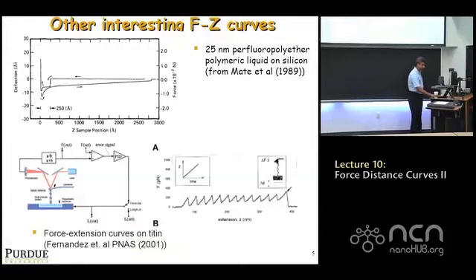Any questions? Yeah? Why, when you move far away, is the slope different? Yeah. So it turns out there are two hysteresis involved here. One is, good question, this one, what we would call short-range hysteresis, and that when you come in, it goes this way. When you come out, it goes out of here. That's one. But the second one is that you're coming in, you have this, and then here you've got this long decay, and then it goes back to zero.